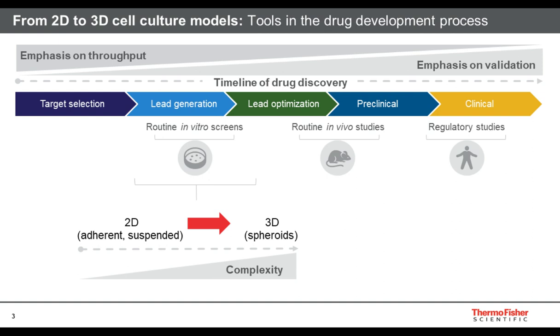So in an attempt to improve the quality of the in vitro screens that are performed at the early stage of the drug discovery process, there has been a progressive shift towards the utilization of 3D cellular systems.